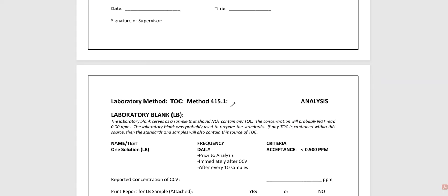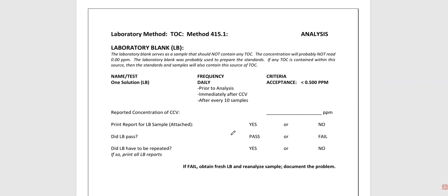All right. Next up is the lab blank. The lab blank is just going to be deionized water, distilled water preferably. It's probably not going to read 0 part per million though, but we need to run it.